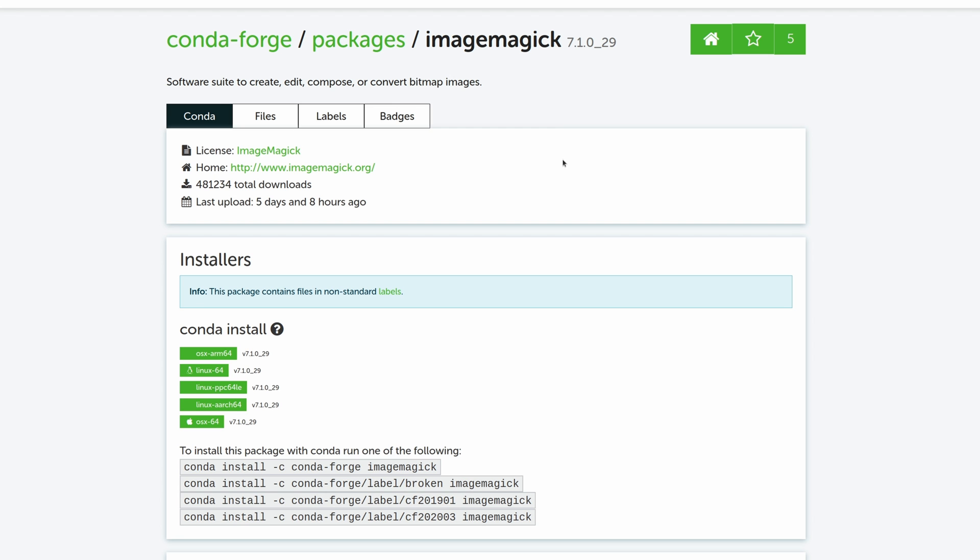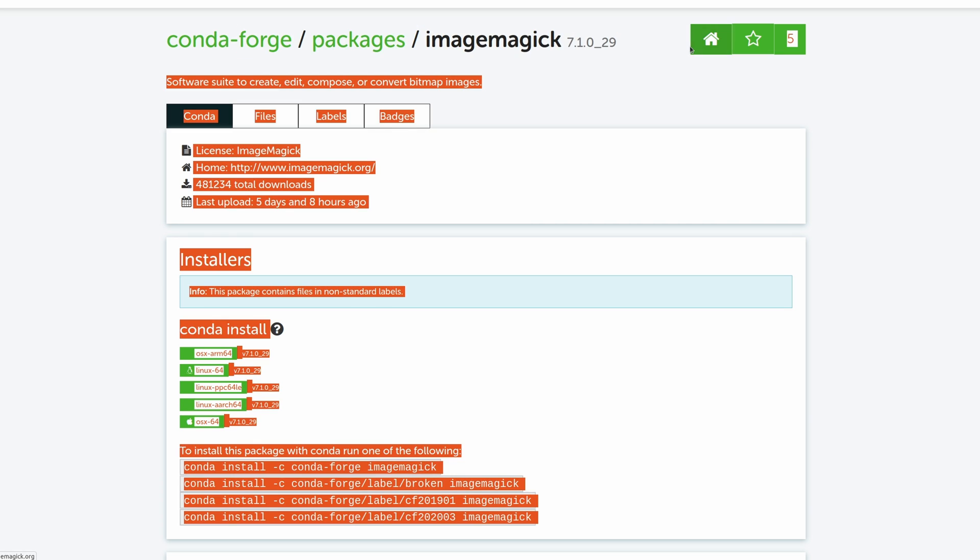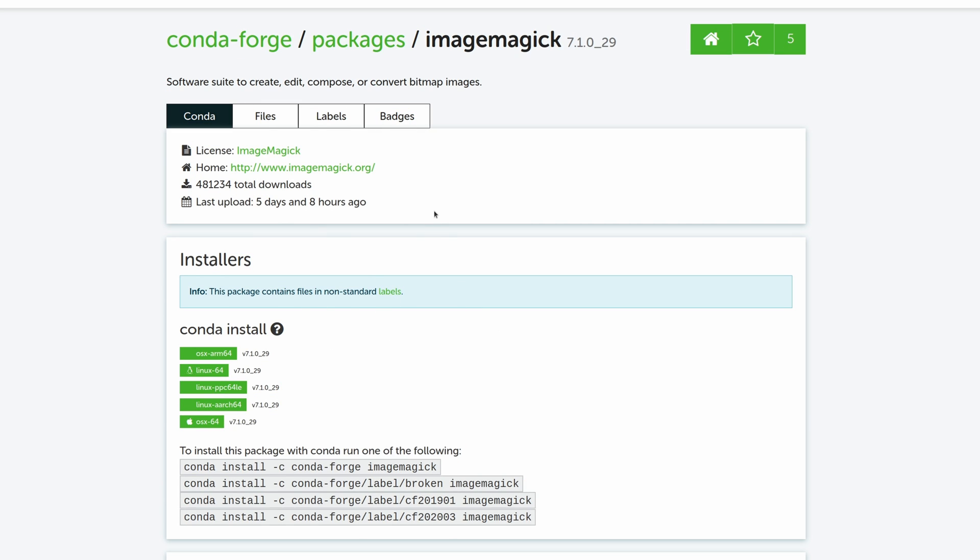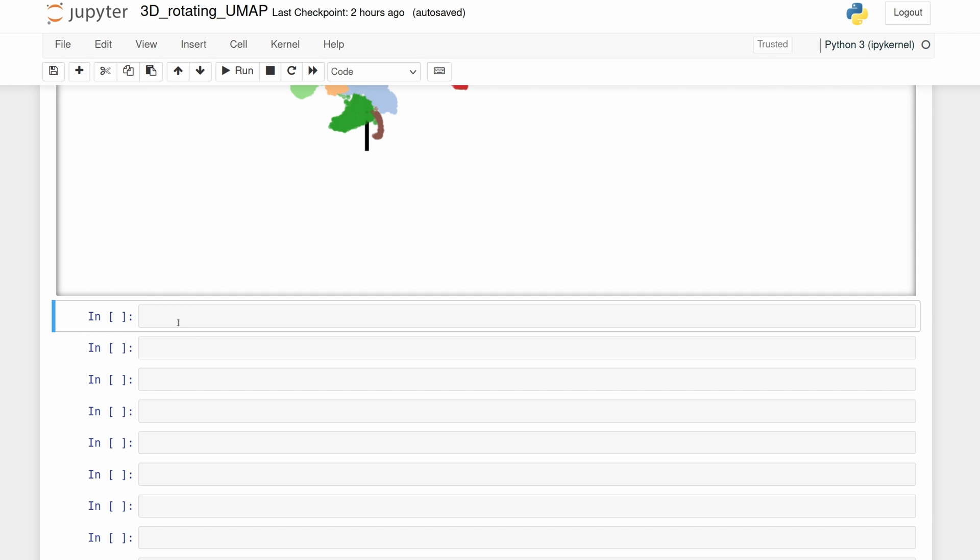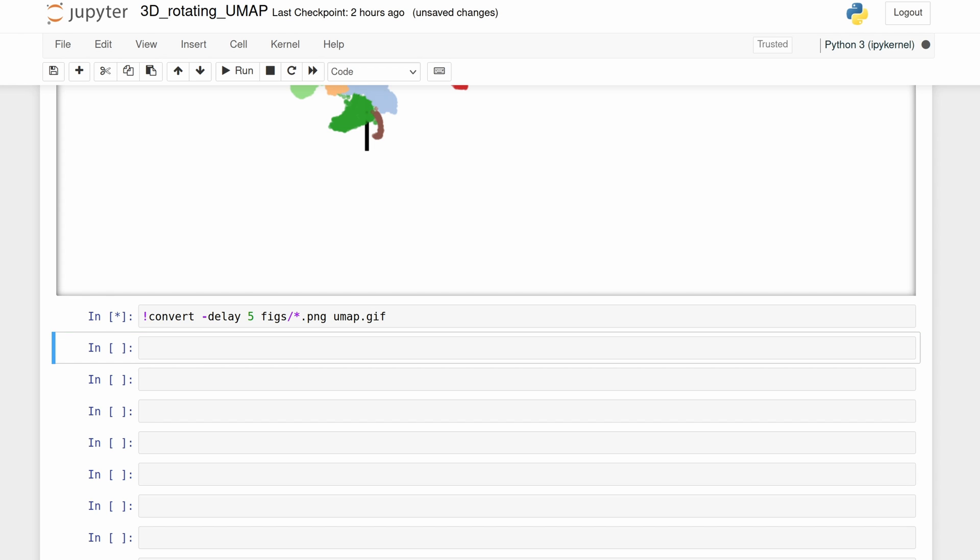So we're going to be using ImageMagick to combine the images. You can install it through conda. Or there's other ways you can install it too if you don't have a conda environment. Once that's done running, it might take a minute or two. We're just going to call the ImageMagick command directly from the Jupyter notebook. But depending on how your system is set up, you might have to do it differently than this. So we're just going to do convert and then add a delay of 5. You can change this to make the animation faster or slower. And then we're just going to point to that directory we just made. All the files that are ending in PNG. And we're going to call it umap.gif. So this should only take about 30 seconds.